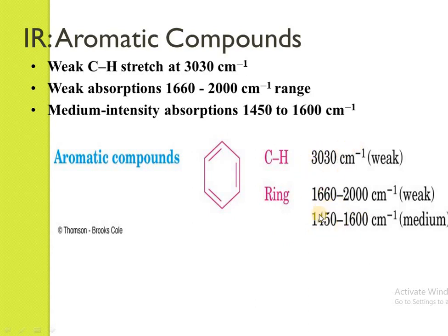Wherever aromatic compounds are present, there are weak absorptions in this range and medium intensity absorptions in that range. So these are the aromatic compounds.